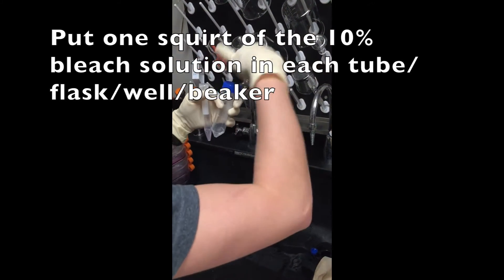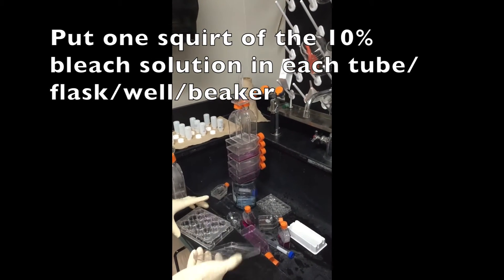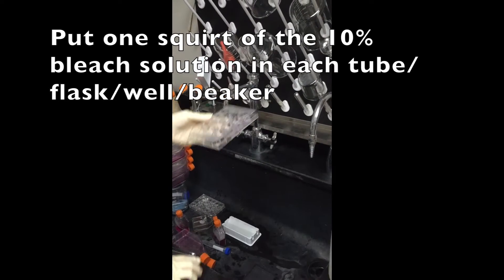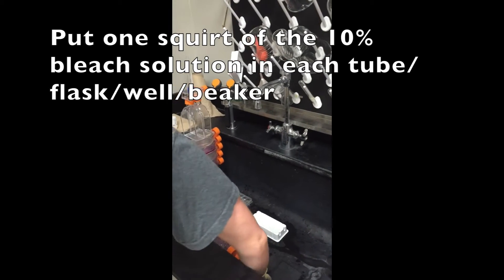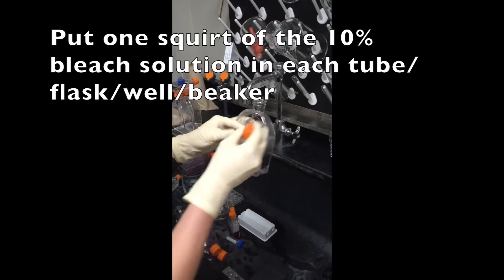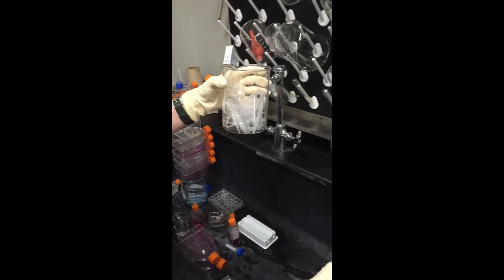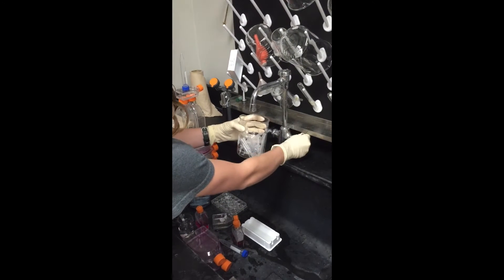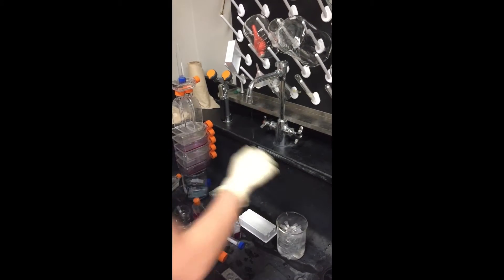Then put the top on, lay it in the sink, and then one of the TAs or someone will come and clean it. So a little bit of bleach in the wells, put the cover back on, set it in the sink. And then for the tips, all you do is squirt a little bit and then you want to fill it the rest of the way with water so that all the tips are sitting in there.